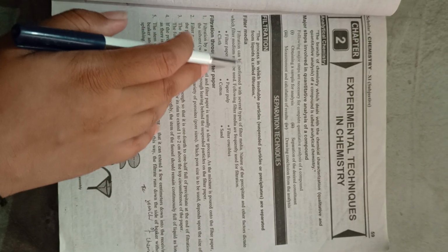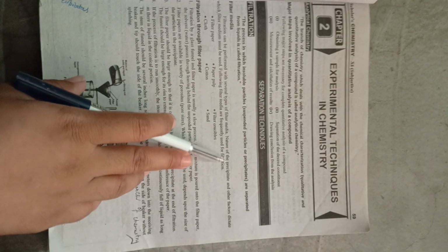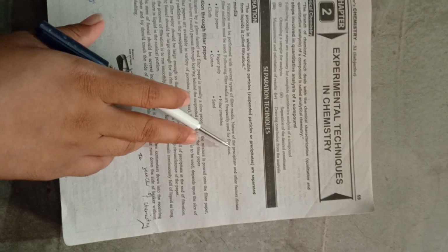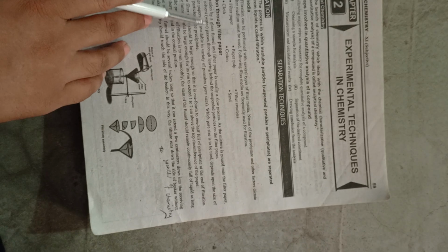Filter media: filtration can be performed with several types of filter media. The nature of the precipitate and other factors dictate which filter medium must be used. The following filter media are frequently used for filtration: filter paper, paper pulp, filter crucibles, cloths, cotton, sands. Filtration through filter paper, filtration by a glass funnel.